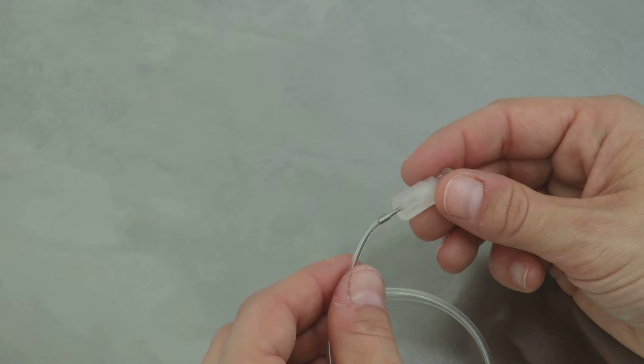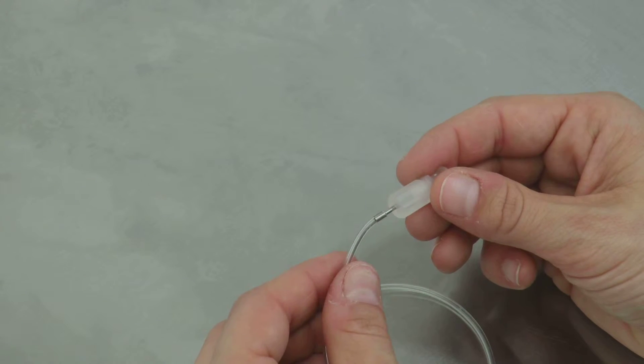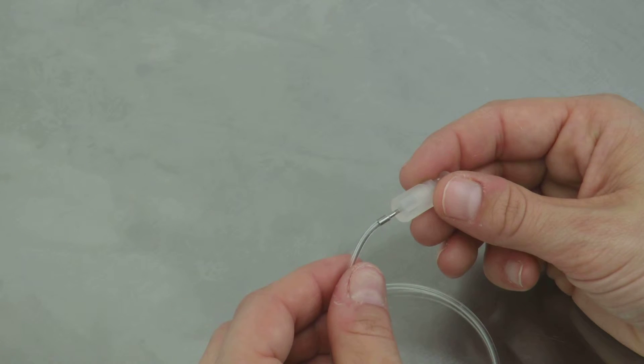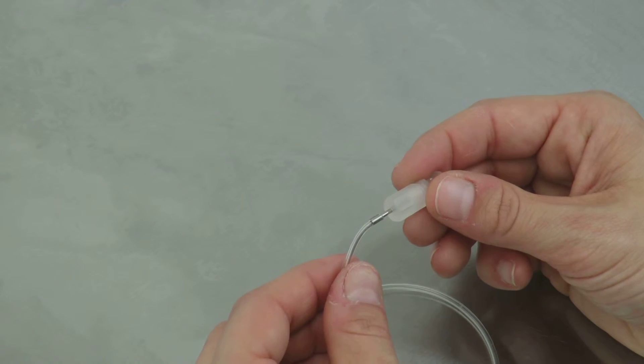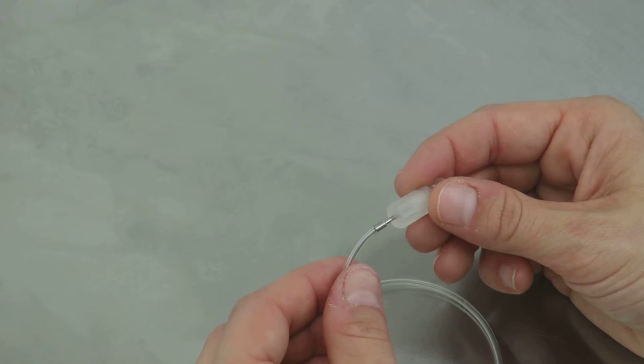Be careful, particularly on the smaller sizes like the 10 thousandths and 20 thousandths inside diameter tubing, because you can bend the stainless element. It's better to slip the tubing onto the barb little by little rather than all at once. Once you've slipped the tubing over the barb at least a quarter inch, you will have a good connection.